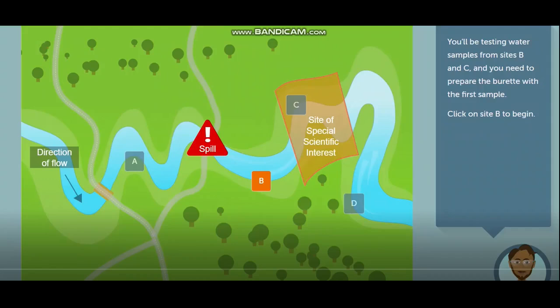So when you are running the titration, it gives you the volume of the solution in the burette, which you will later use to calculate the unknown concentration. If it's not clear now, later it will be clearer. Let me repeat what I said. There are two volumes we are working on, one for the pipette and one for the burette.